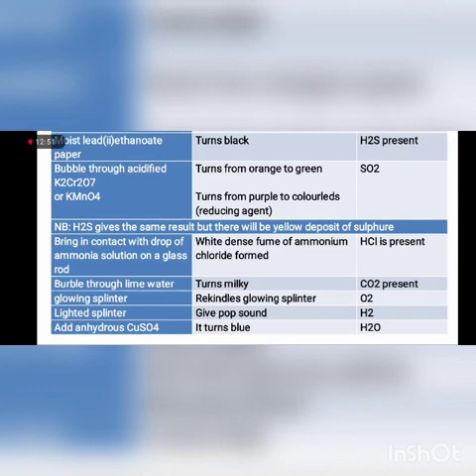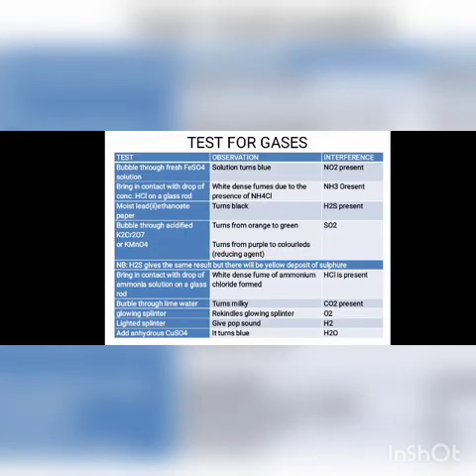When you add an unknown substance to anhydrous copper 2 sulfate and it turns blue, that shows that the compound you are looking for is water. So this is specific identification of gases through their tests. So that shows that you can trace a particular compound through the appearance of the compound, or by flame test, or by heating to know the gas that will be involved, or by a specific test of a gas to determine the kind of compound it was liberated from. Thanks for listening.